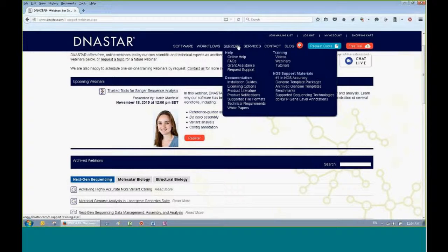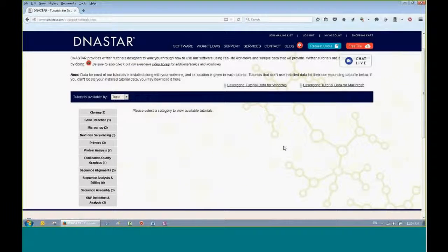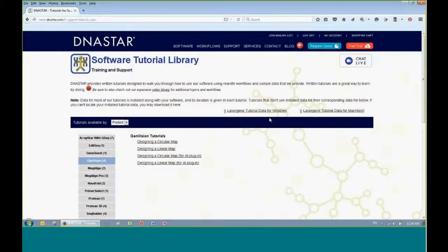I also wanted to point out that we have a wide variety of written tutorials for all of our products. If you work better with something written in front of you instead of a video, and again, these are organized by either topic or by product name, you can click on those and get a nice written tutorial to follow. And we have the practice data available for download right here, so you can follow right along with those written tutorials.